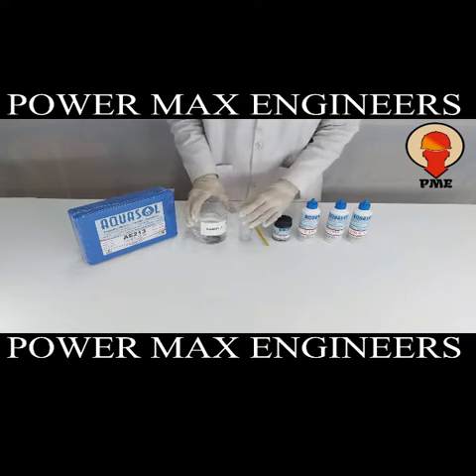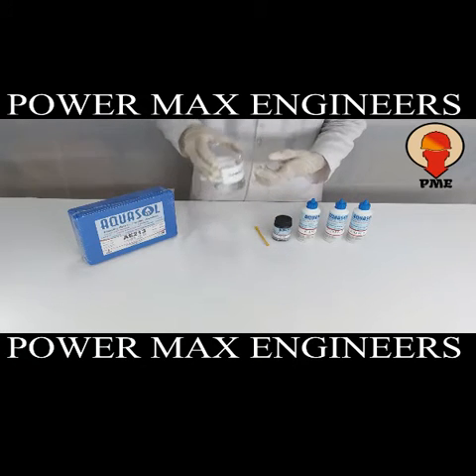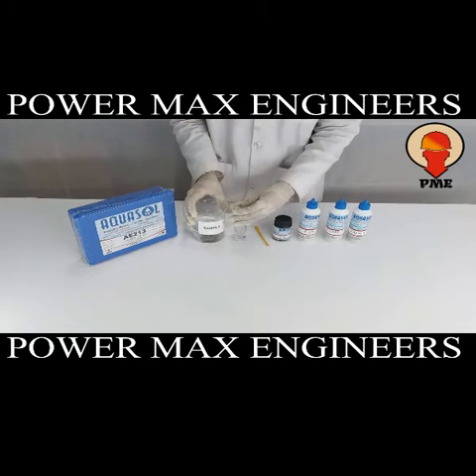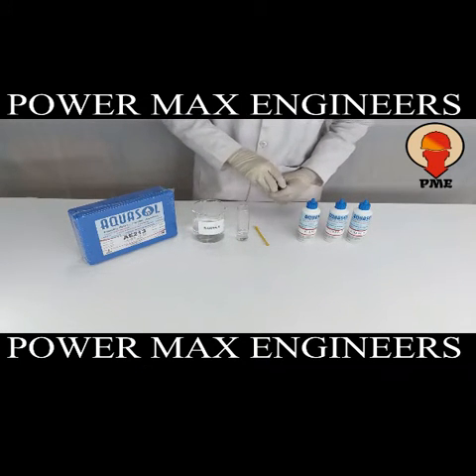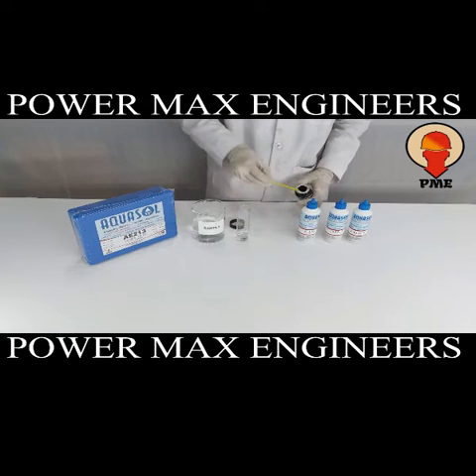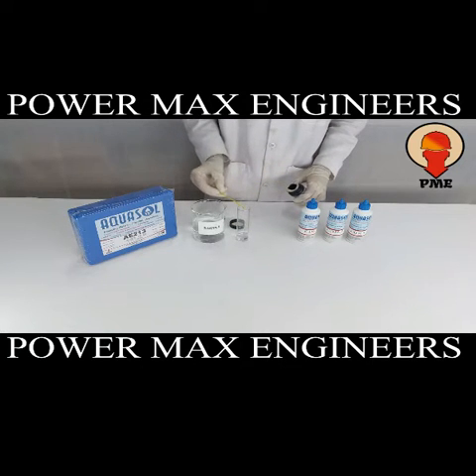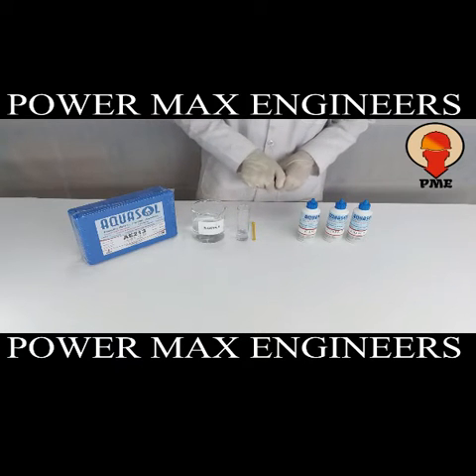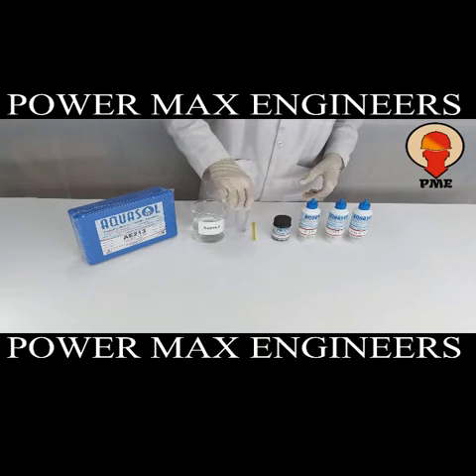Take the test jar and fill the sample up to the 10 ml mark. Now add 1 spoonful of CD1. Then close the bottle tightly and mix well to dissolve.